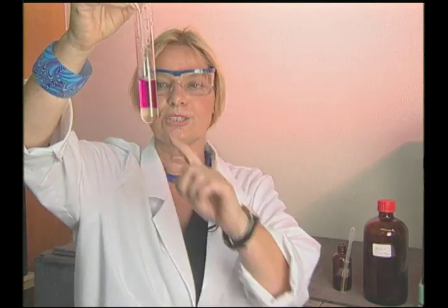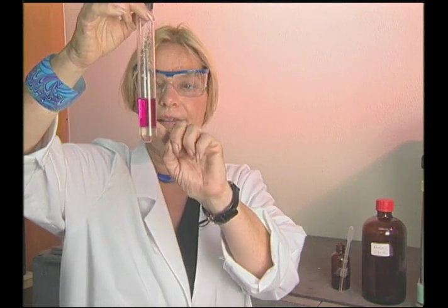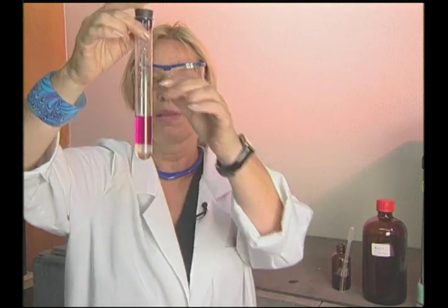And if I shake it more vigorously, you see the bottom is practically colorless. So all the iodine is now where it wants to be, in the non-aqueous part of the surroundings. So all the iodine molecules moved into the top layer.